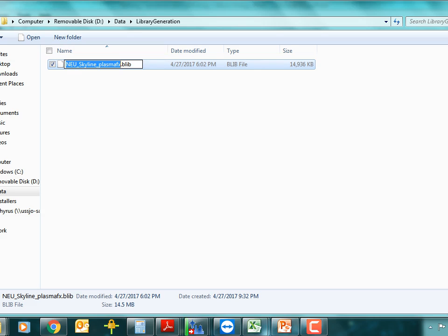So just right, just so this is the file that you're going to be looking for from within Skyline, okay?